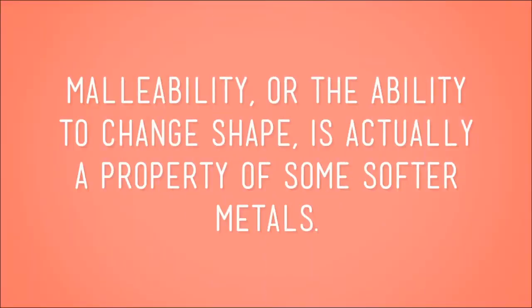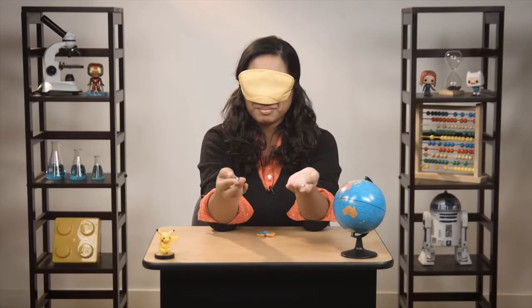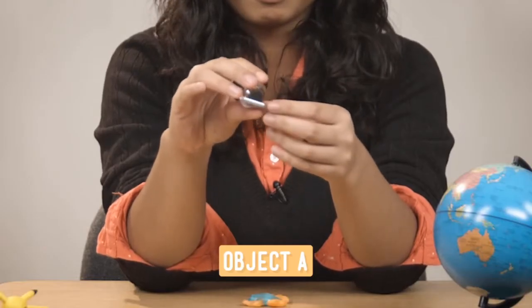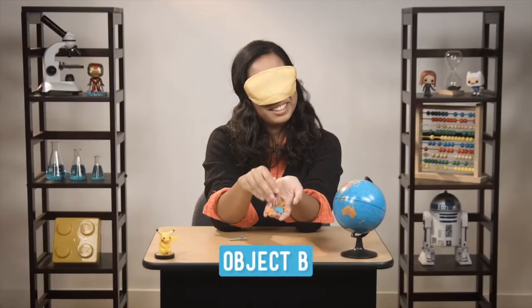Ew. So far, we can make the guess that A is metal, but in science, the more evidence, the better, because malleability, or the ability to change shape, is actually a property of some softer metals. So we need more data. Let's bring in our trusty magnet. As you can probably see, because I can't, object A seems to be attracted to the magnet, while B isn't.